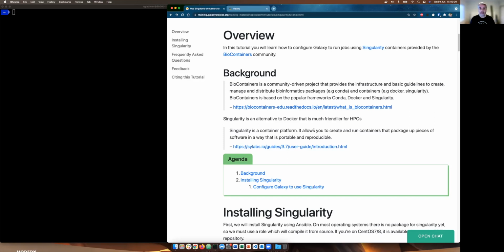And this will allow for us to always be reproducible, because if we ask for the BWA 0.7.15 version 1 Singularity container, that's the one we're going to get. And it's always going to have the correct dependencies installed. It's going to be the same forever, because all of these Singularity containers are hosted at biocontainers for us. And we can just pull them down anytime we wish.